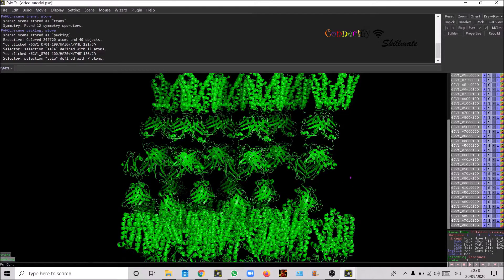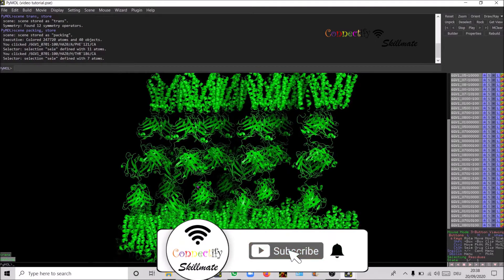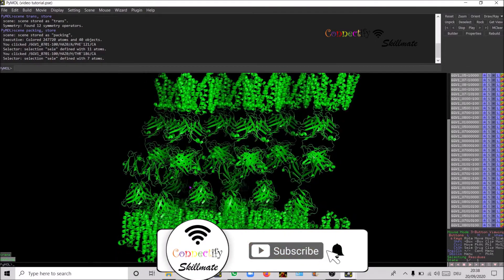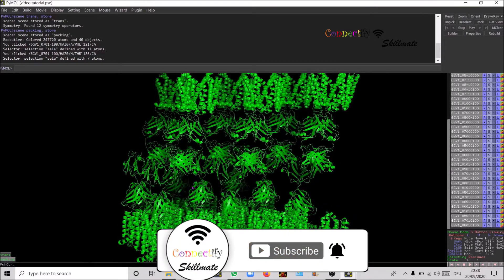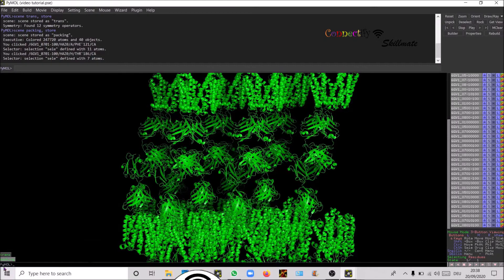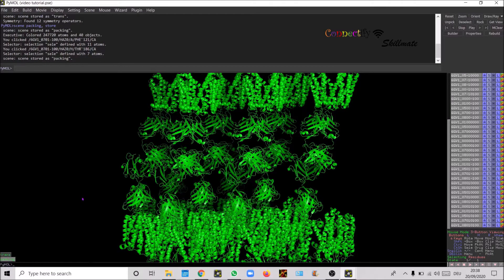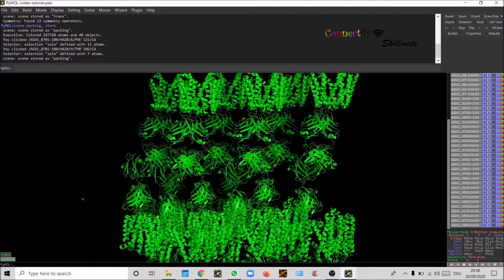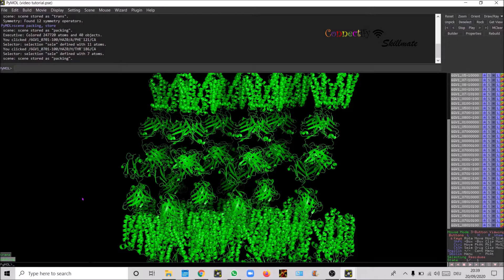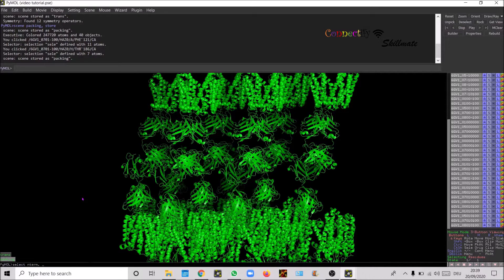Probably you can add and remove the molecules that you want to show and not show and make a nice packing figure. Now let's define the selection.